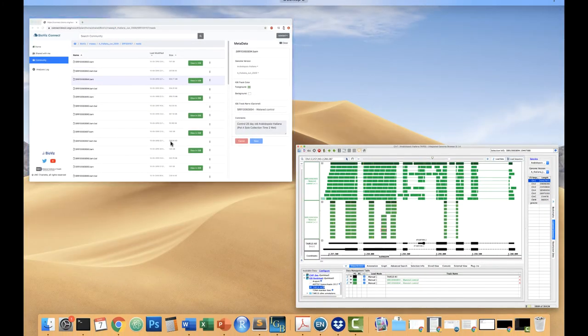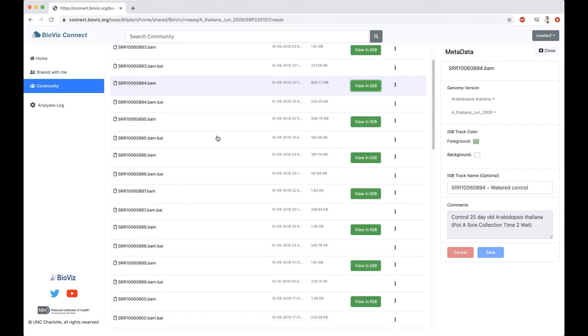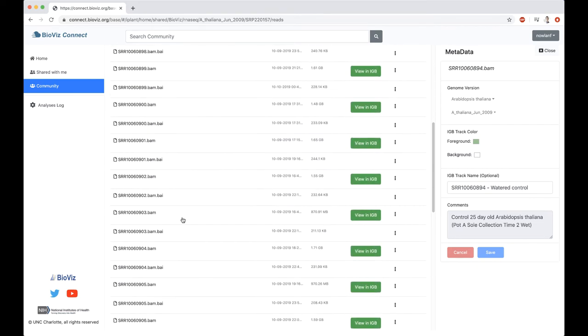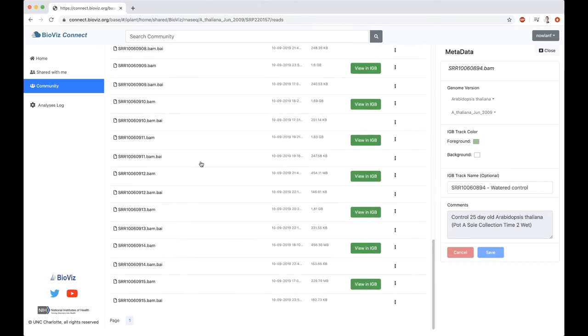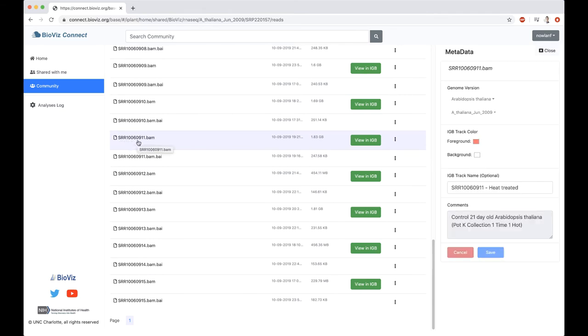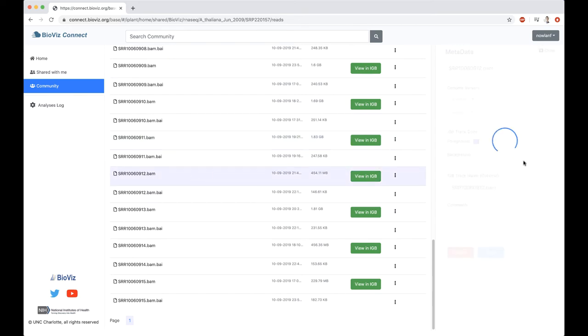I'm going to jump back to BioViz Connect. The second dataset I want to look at is down here at the bottom. It's the SRR10060911. Here again, we've got a disparity between two of our files. I've got a 1.83 gig, and this 91112 is a 454 megabyte. This 91112 is several times smaller than what I think it should be. And the 91111, this is Arabidopsis data, in this case, this is a heat-treated sample, foreground color of red, and these were 21-day Arabidopsis thaliana. And the 91112 should be the same. Heat-treated, foreground red.